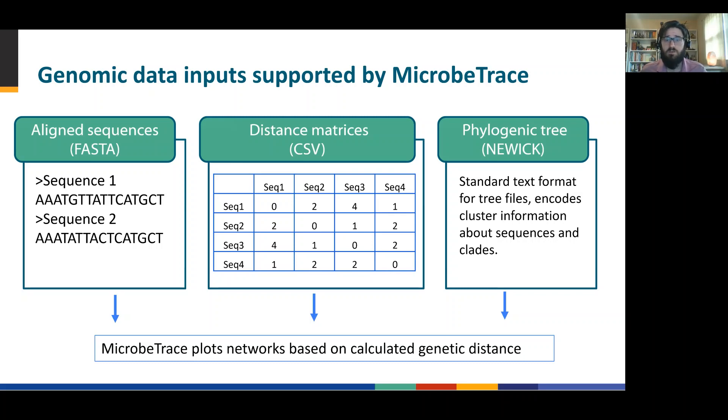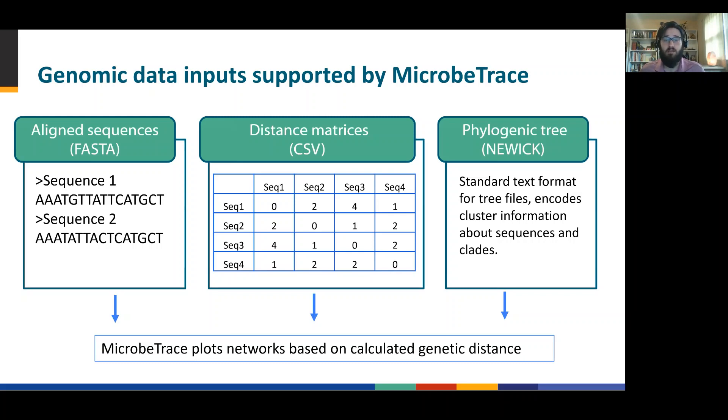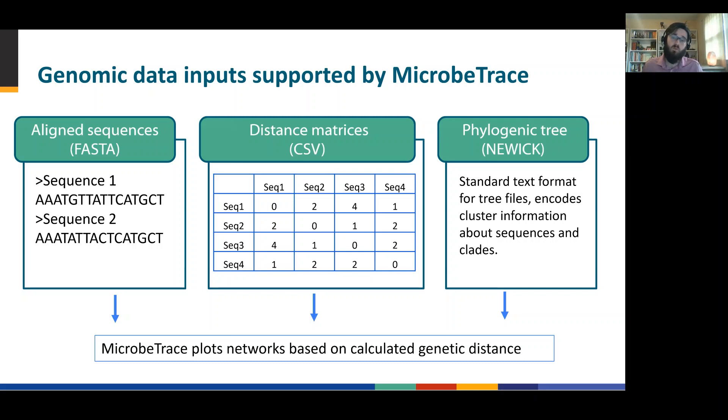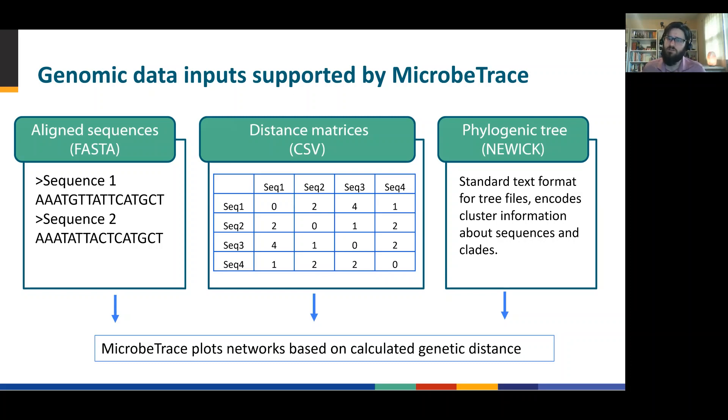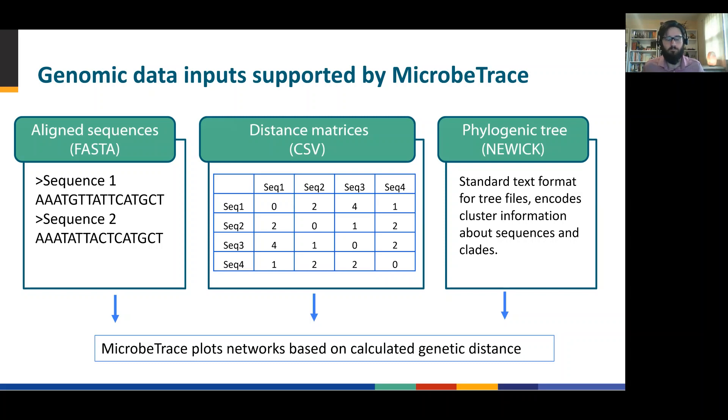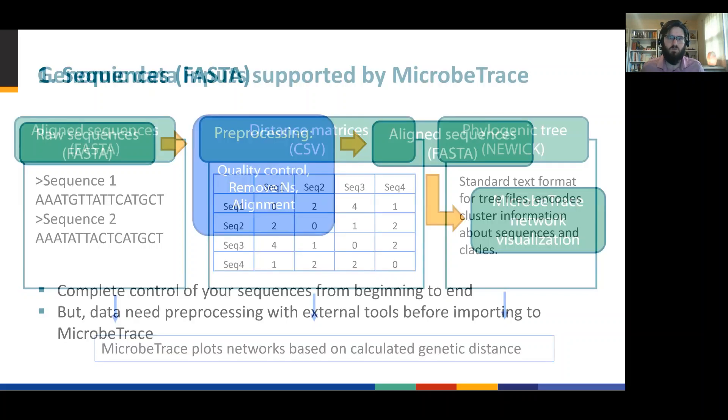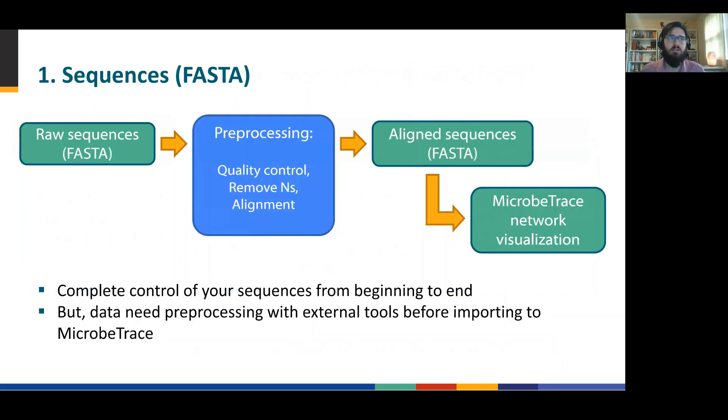We also accept distance matrices. For the more advanced users that may have their own analytic approach to devising genetic distance, you can collect your distance matrix and we will import that and render pairwise links. And for those more comfortable with phylogenetic trees, we accept the Newick format. What we'll do is take that tree and crawl it to understand pairwise distances on that tree so that we can render it as a network.